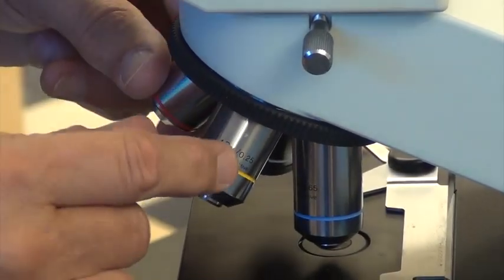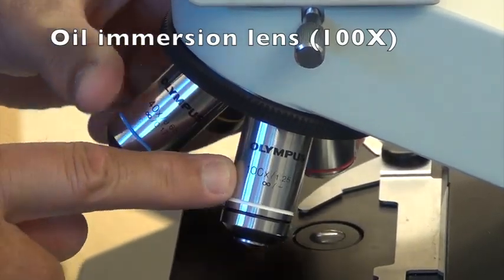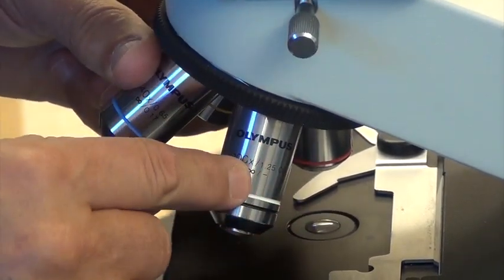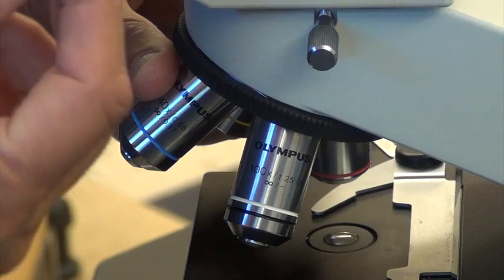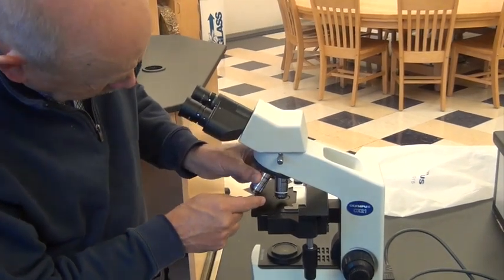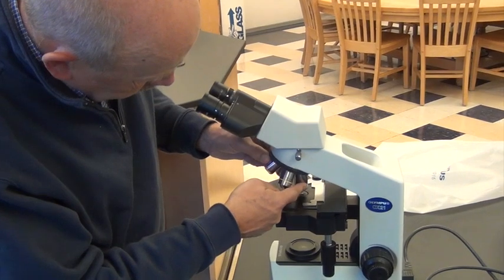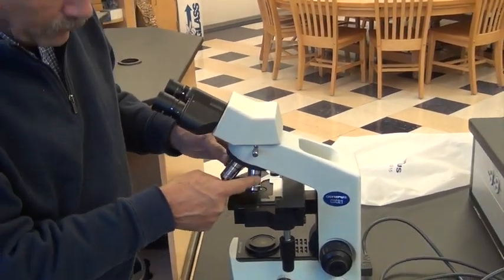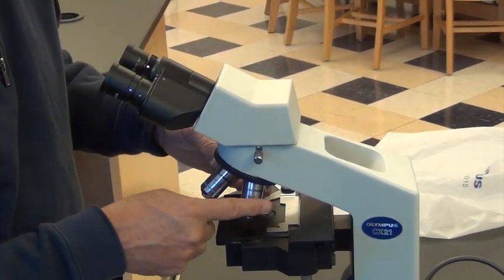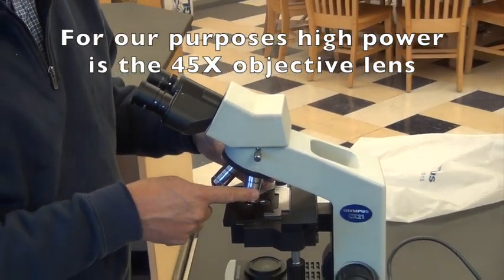To review, we have scanning, low, high, and then finally oil immersion, which is somewhere around 100x, sometimes a little less. It needs a drop of oil — almost a liquid lens — to allow it to be that powerful. There's not much room even at high power, so the only thing that would allow this to be more powerful is something bendable like a liquid, and it's a special oil. We will not use that lens objective very often, generally only for bacteria.